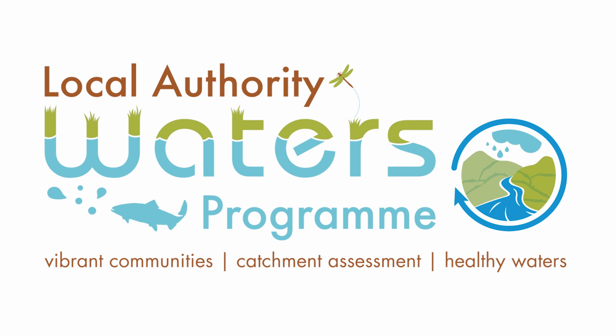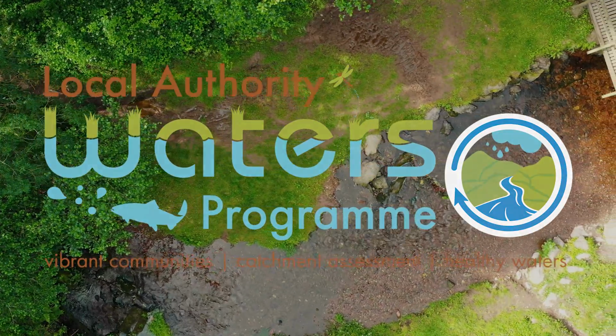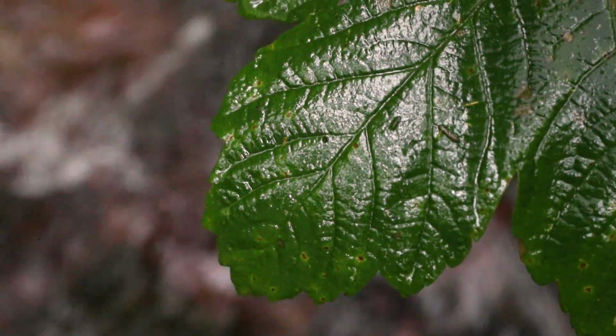Welcome. This video is intended to demonstrate how to effectively perform a macroinvertebrate kick sample. It will introduce the various habitat and substrate types and how to select the appropriate areas to sample, as well as how to obtain a clean sample for examination.